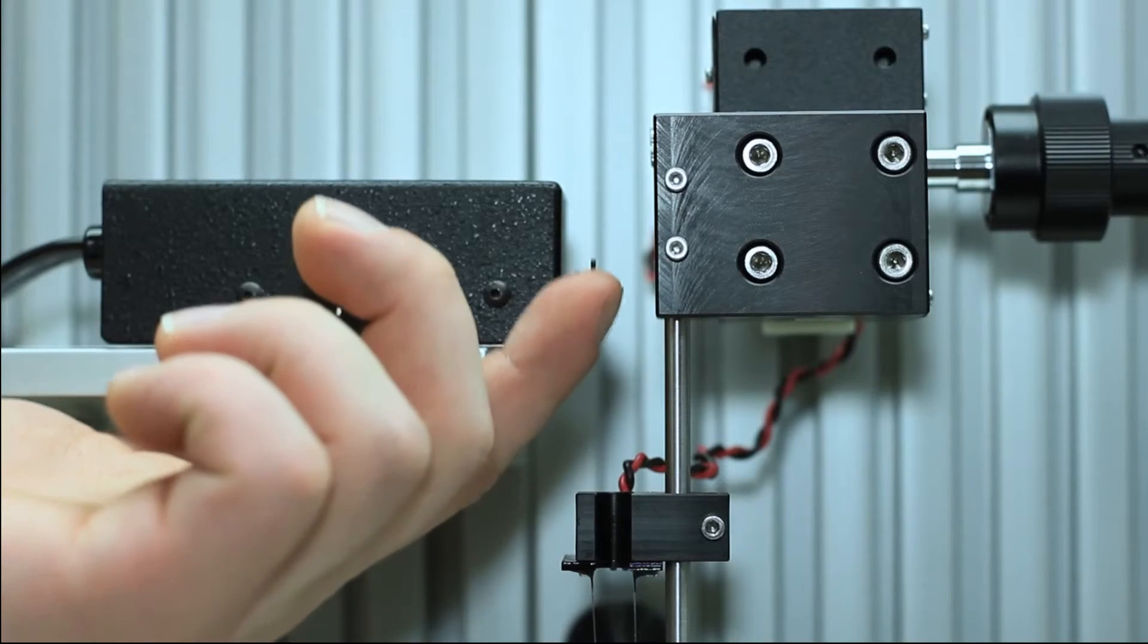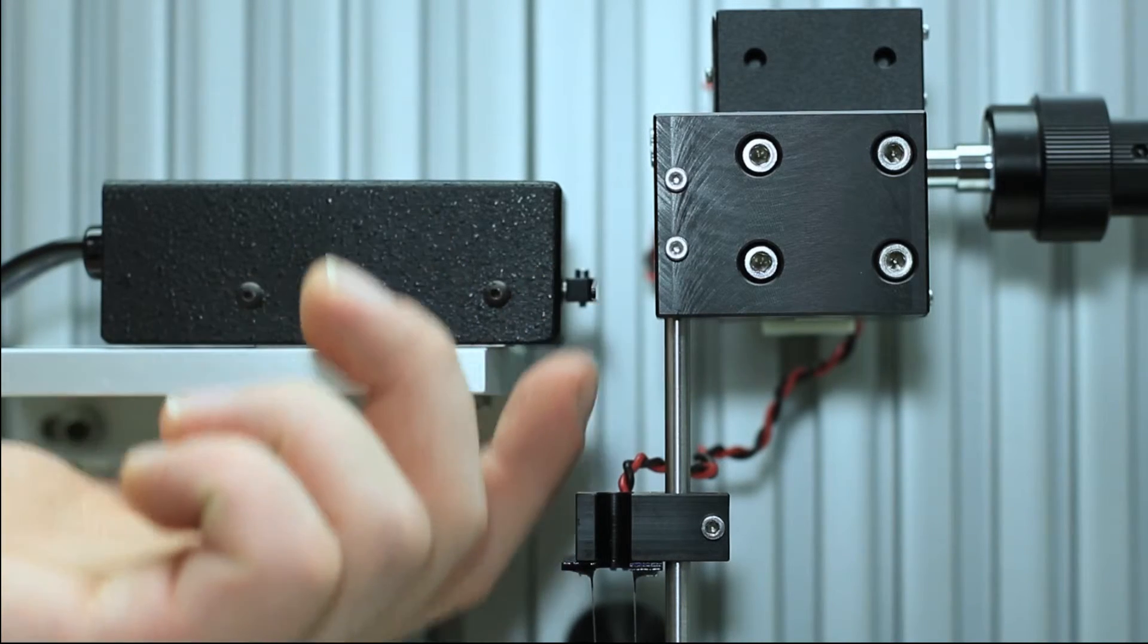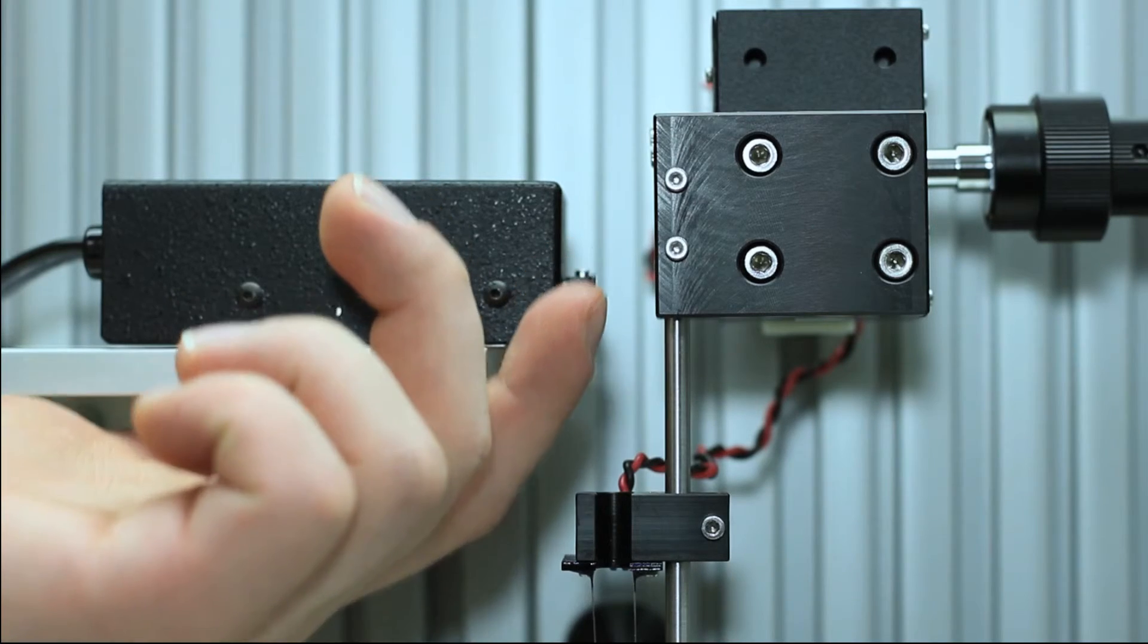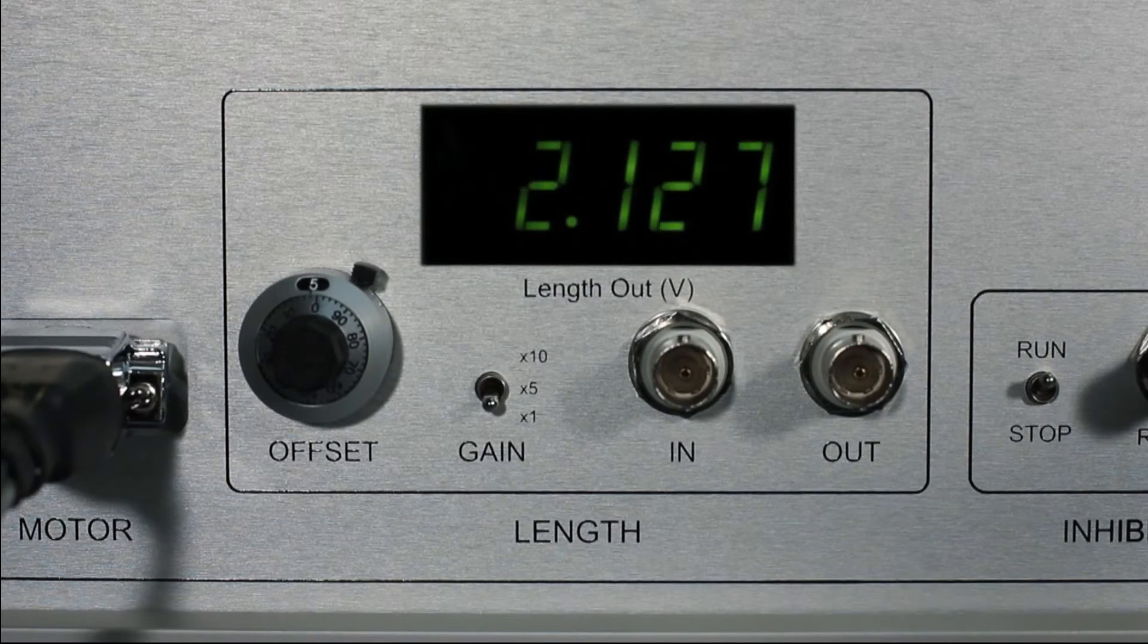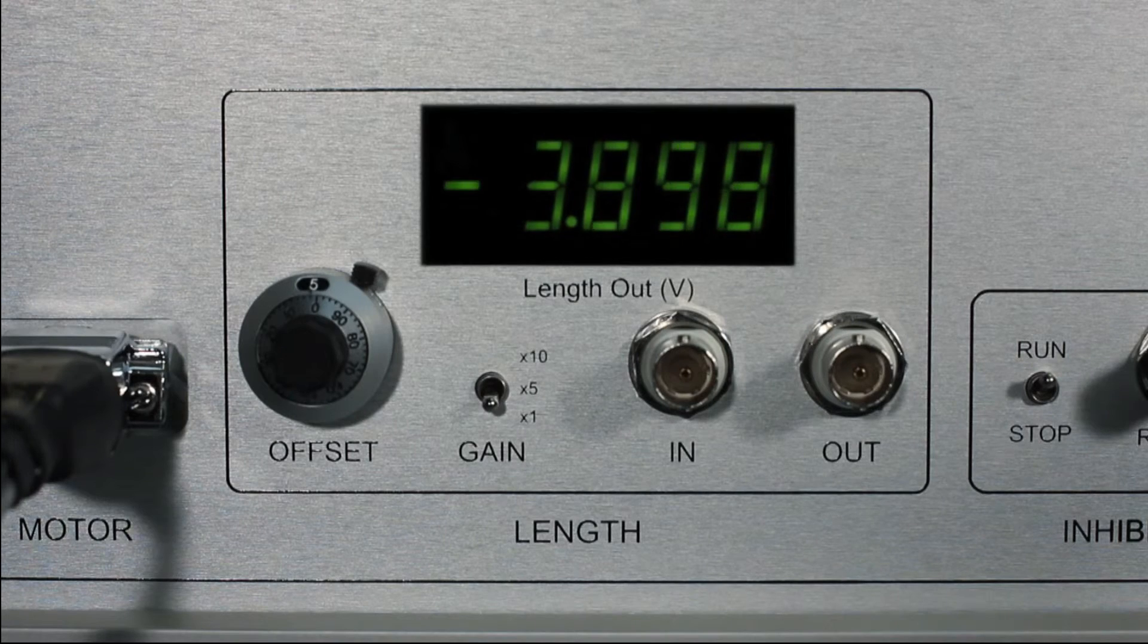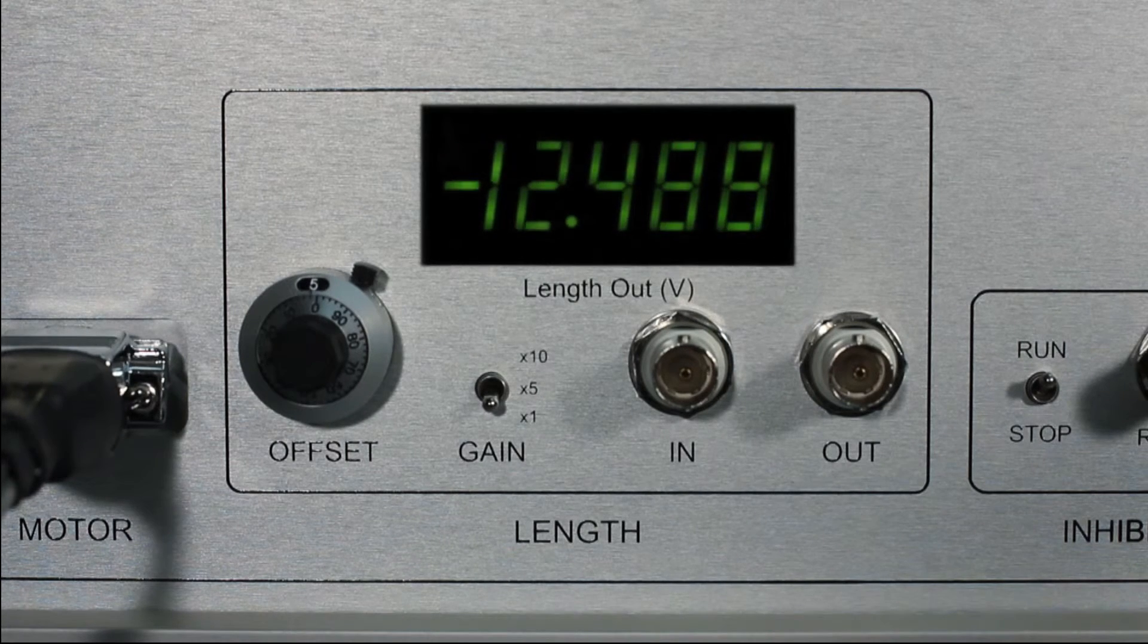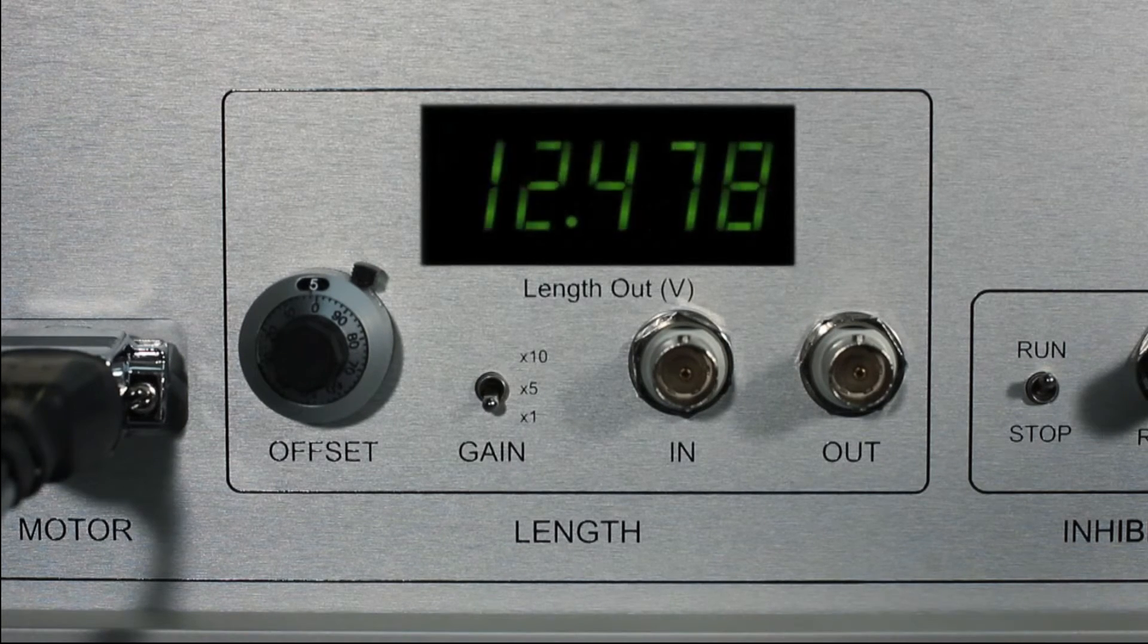Slowly move the lever arm back and forth. You should feel almost no resistance. Observe the length out display as you move the lever arm. You should see the display move between negative 12 and positive 12 volts.